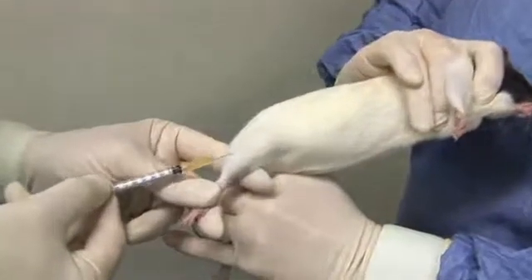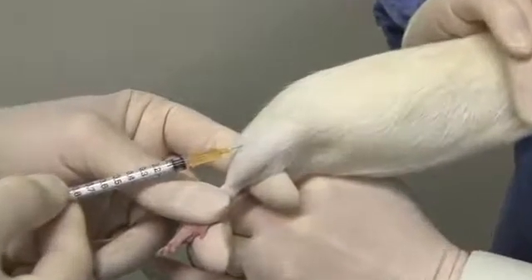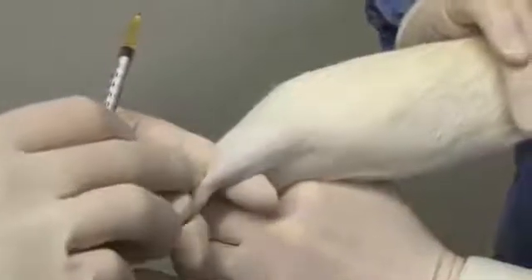The needle is inserted into the muscles at the front, or as shown here, the back of the thigh, and the injection is made slowly and steadily. The needle is then withdrawn and the rat placed back into its cage and released.